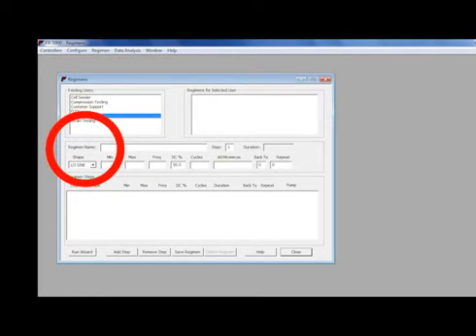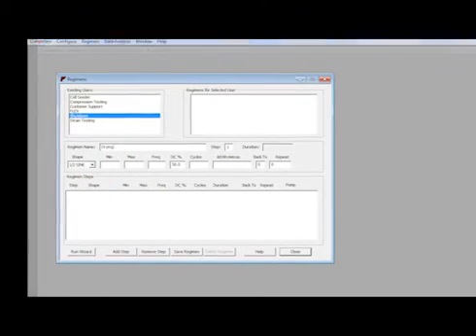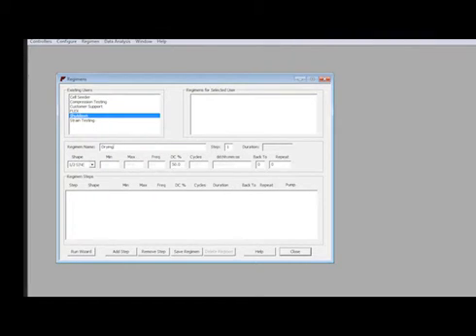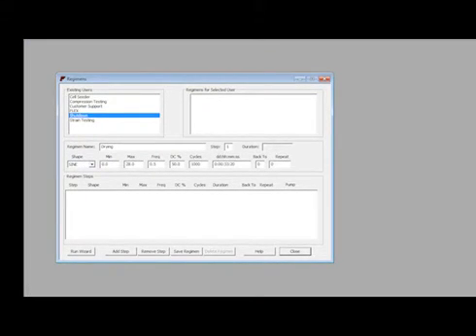In the Regimen Name box, type in a name for the regimen, such as Drying. Enter the regimen parameters as shown here.